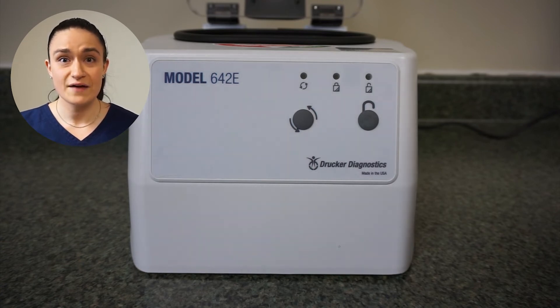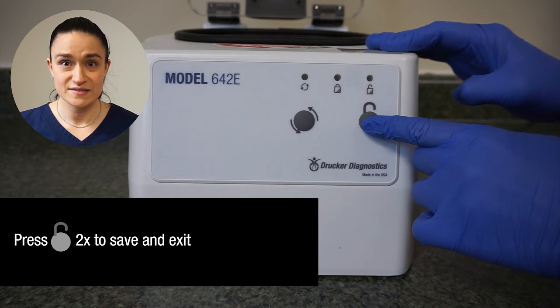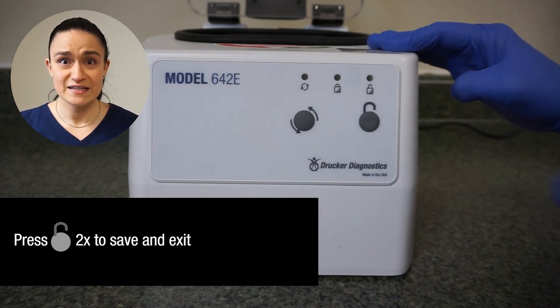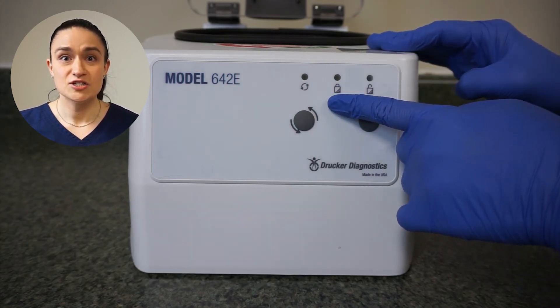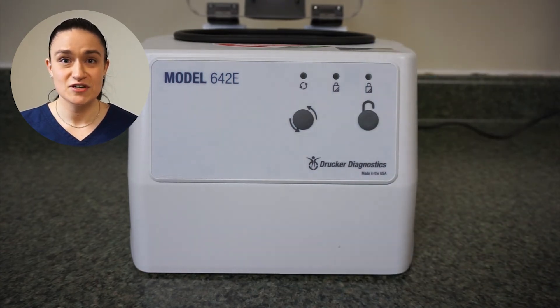Once you have your spin time programmed appropriately, press the stop/unlock button twice. The yellow LED in the middle should no longer be illuminated. This indicates that your centrifuge has returned to its normal operation.